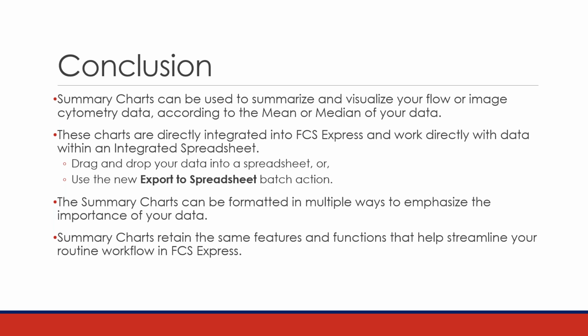But for those of you that are familiar with the functionality of our spreadsheet, you know that you can just drag and drop different data points into that spreadsheet. You can drag and drop data files into that spreadsheet and then select the information that you want from that spreadsheet. Or you could use the new Export to Spreadsheet Batch Action tool.